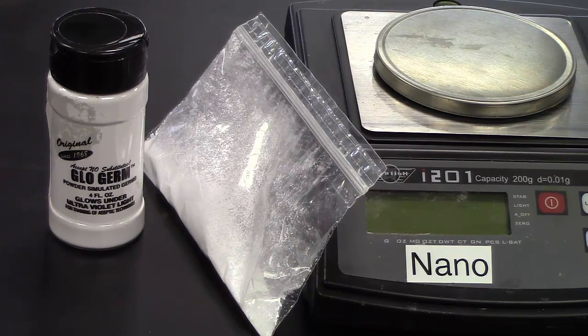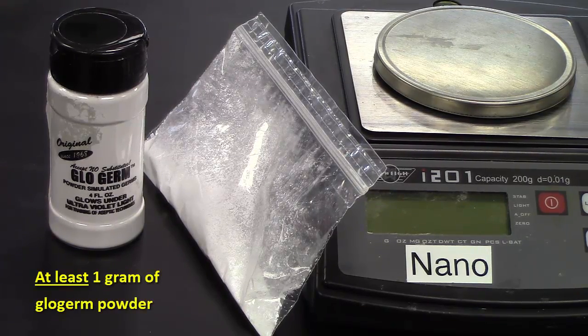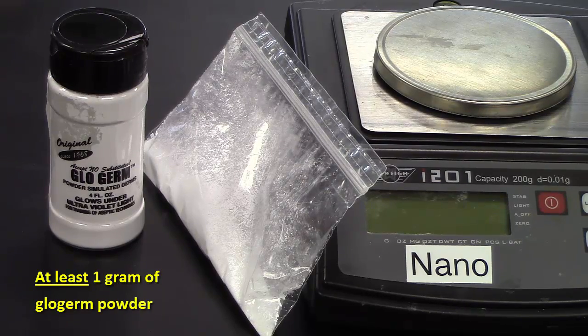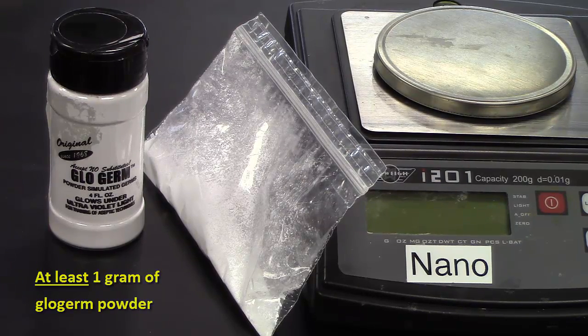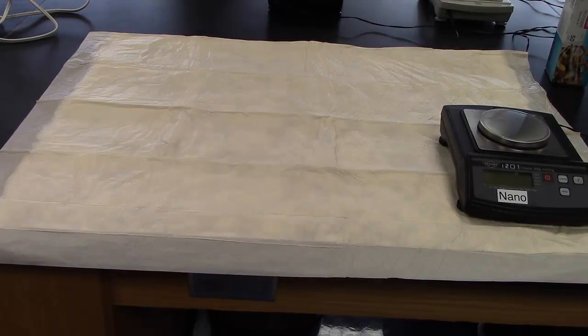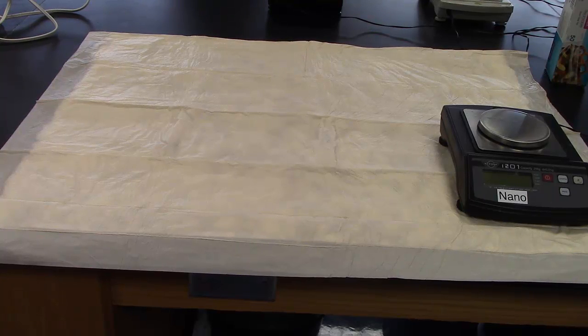Using a spatula or scoop, measure and pour at least one gram of the glow germ powder into a small plastic snack bag and seal it. Set up the bench top by placing an absorbent pad over the area you intend to work, then place the laboratory balance on the absorbent pad.